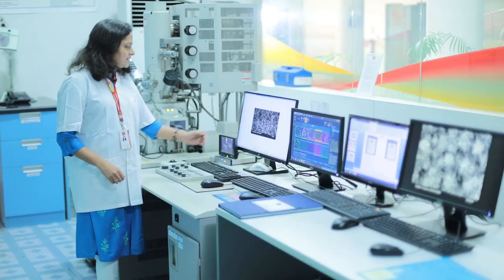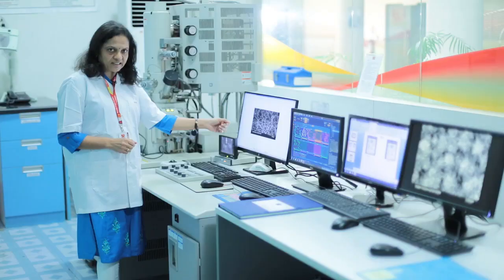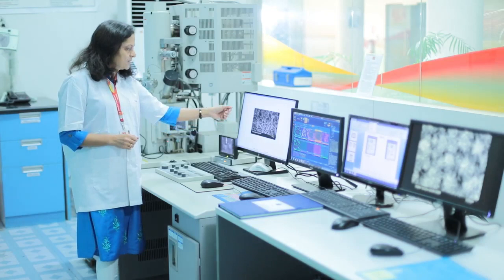So this carbon nanofiber is magnified 30,000 times and here we can see each and every strand of the microfiber very clearly. It shows that the diameter of the microfiber is very uniform, which shows that the end product is going to be very strong.